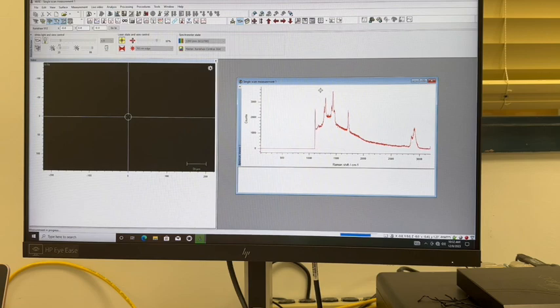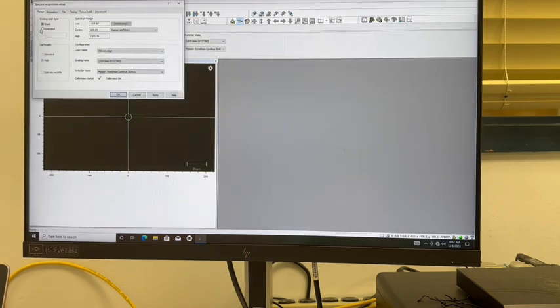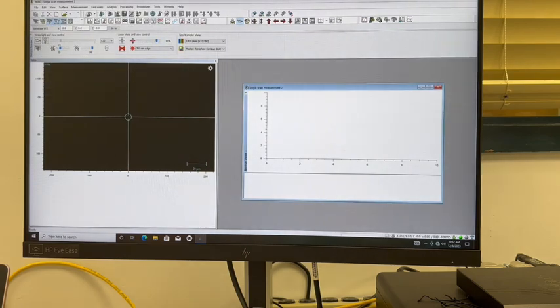As you can see, the increase in laser power has created significantly less noise in this spectra. However, there was just another solar flare, so we will go ahead and delete this measurement and retry this measurement. In this next measurement, we will continue to do the extended scan. However, we will use 100% laser power. This should give us a clean spectra.